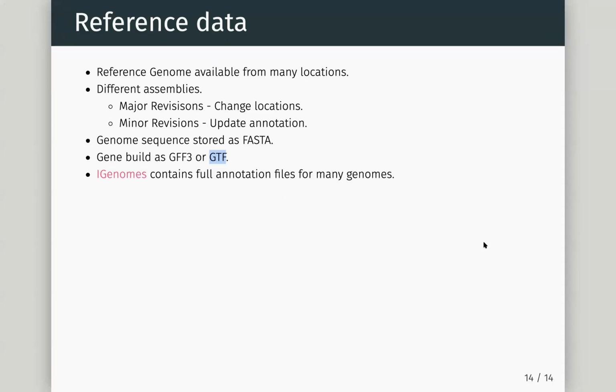I'm going to stop it though. So I can tell you, once you download that, that is probably 40, 50 gigs. It's a lot of data to download. It may be smaller, but you're going to unzip it and it's going to be huge. But iGenomes is a really good source.